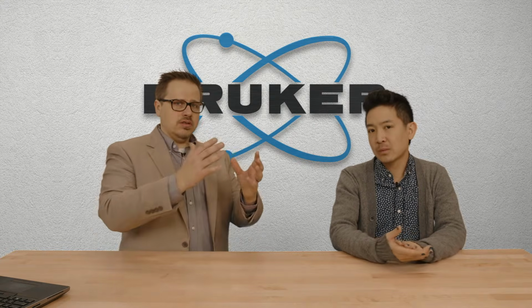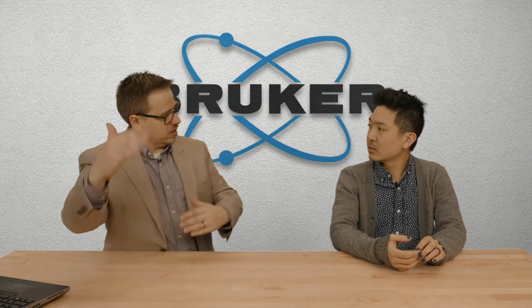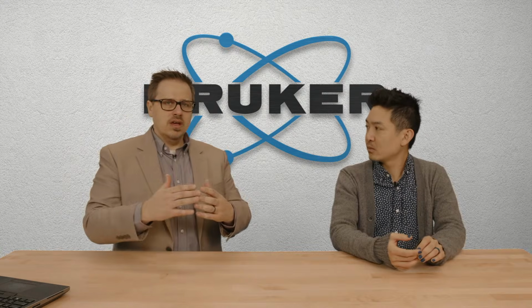So you had mentioned, EVA does the data display, and we can look at 1D data, we can look at the 2D, actually coming off a 2D detector, or we can make 2D images out of 1D data, kind of multiple sets. We can do this phase identification, which is like the fingerprinting. We can do something kind of quantitative. Sometimes we call that semi-quant, right? So we get a rough idea how much is there.